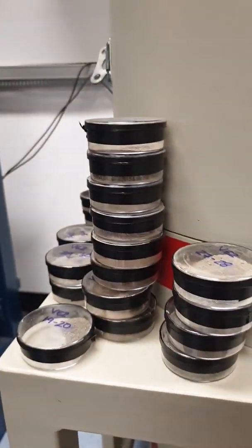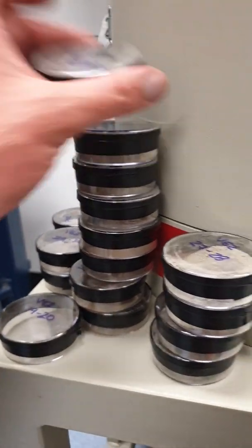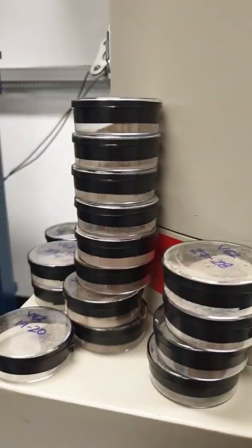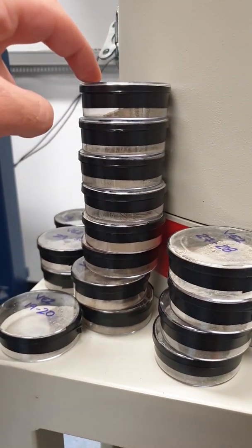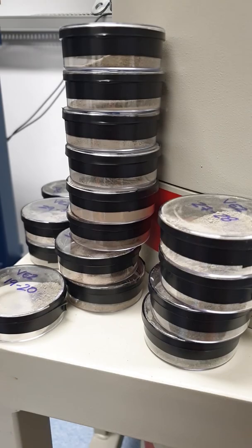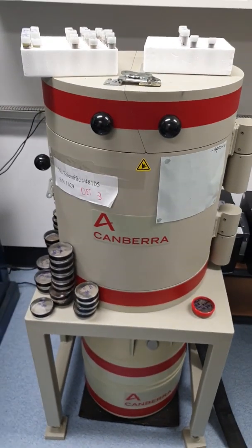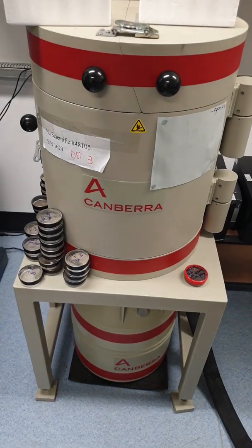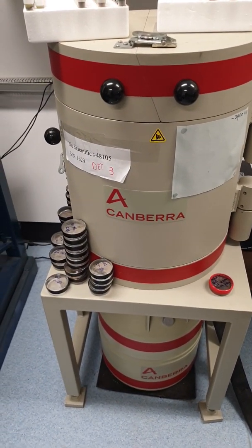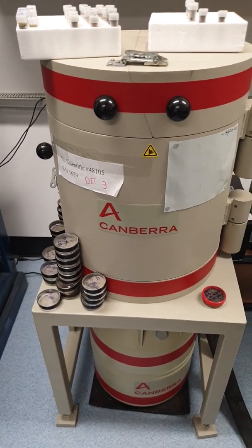We look for radioactivity in a sediment core. These are samples of sediments. As we start at the top we'll have more radioactivity in our sediment core, and as we go down we'll have less and less. Using these machines we can sample the sediment cores and then we'll be able to date them to know when that sediment has accumulated.